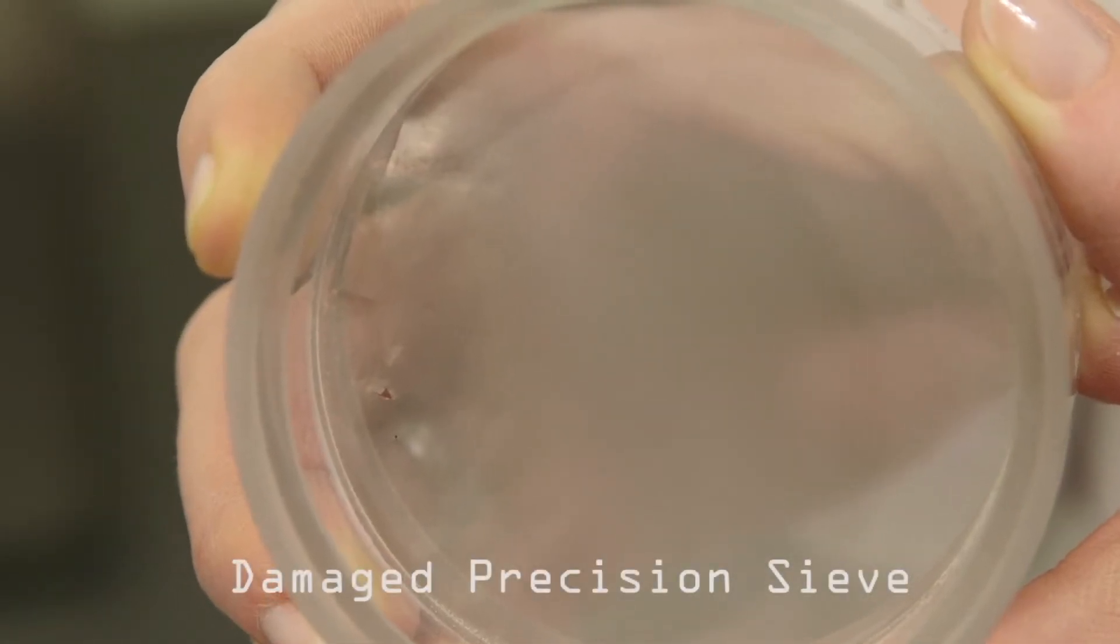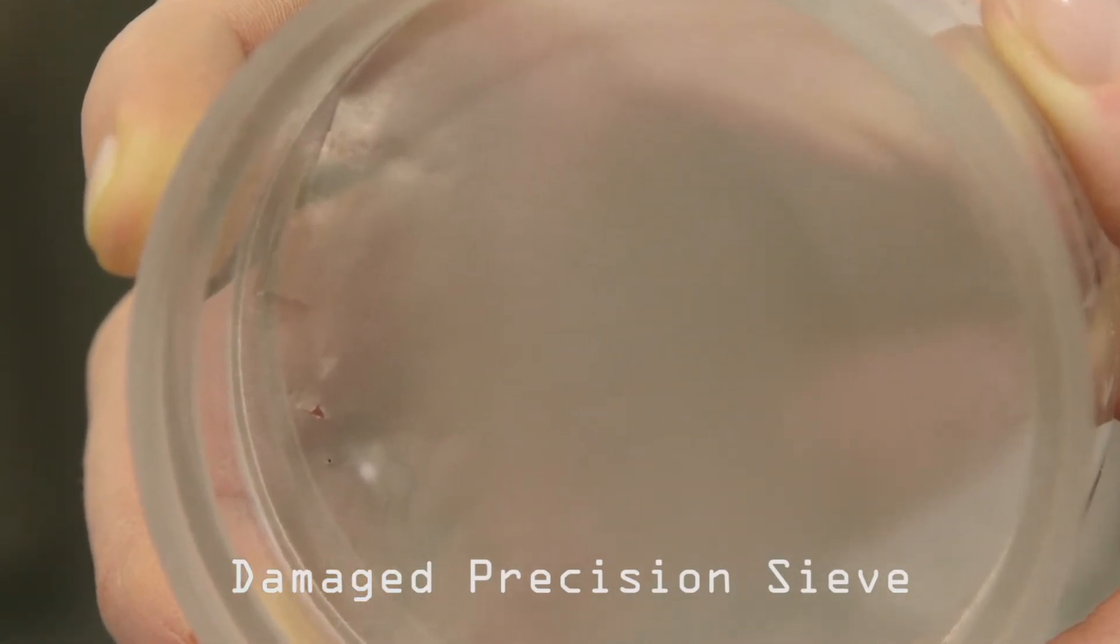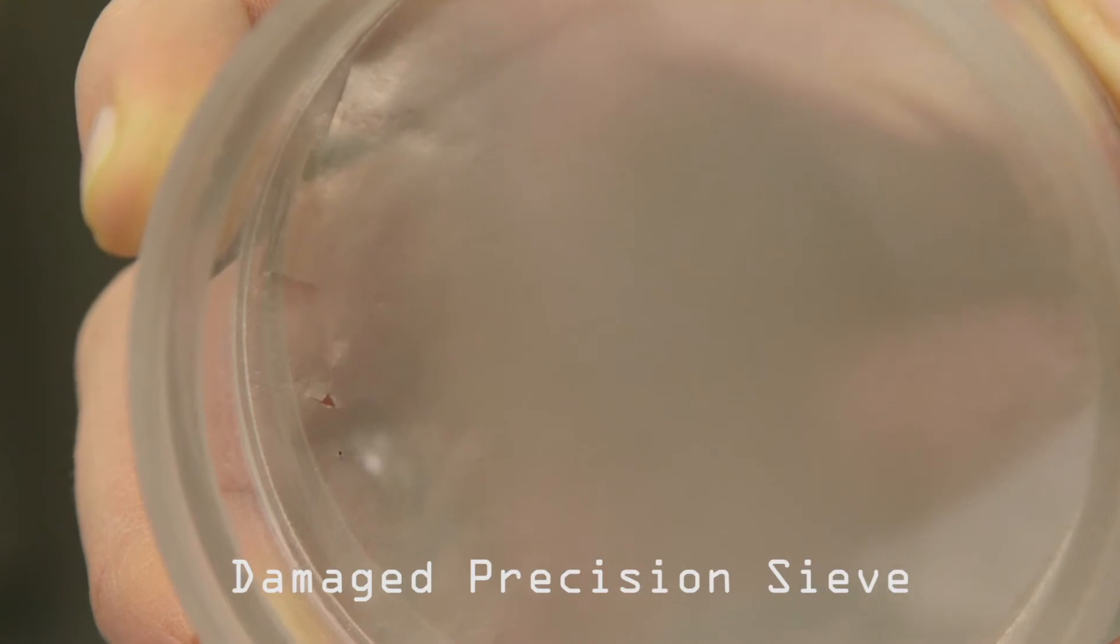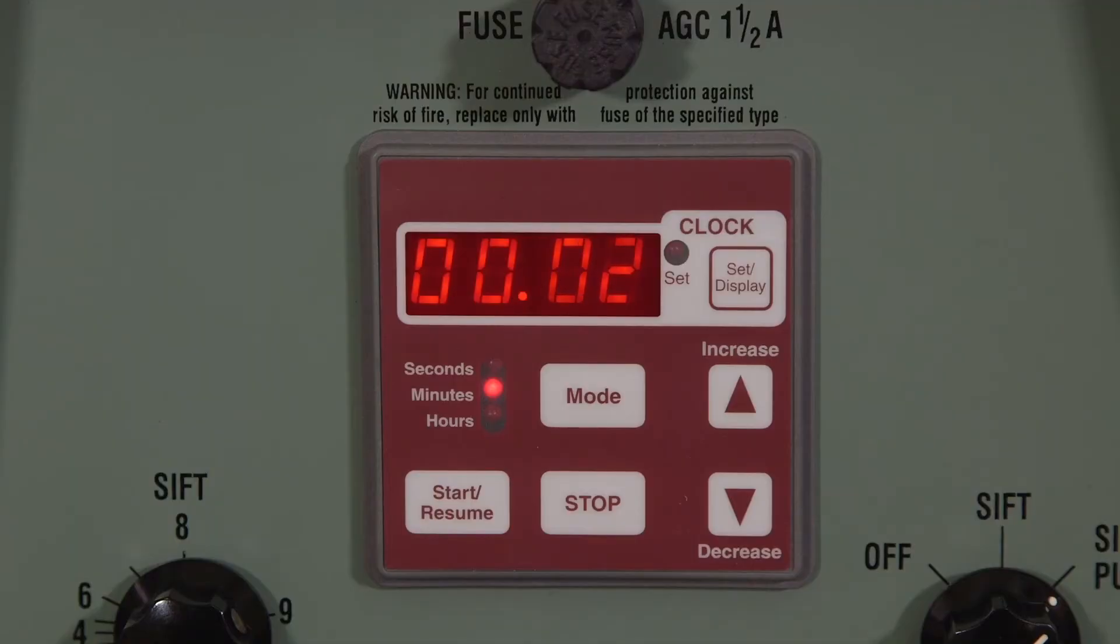Excessive amplitude may exacerbate electrostatic charge problems, contribute to equipment wear, and possible sample loss. Precision sieves are especially prone to premature or immediate failure if run with excessive sample size, excessive amplitude, or if on an extended test cycle.